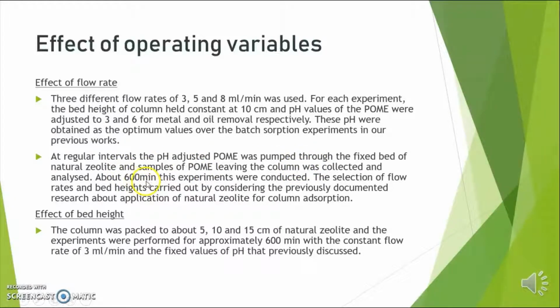About 600 minutes, this experiment was conducted. The selection of flow rates and bed height was carried out by considering previously documented research about the application of natural zeolite for column adsorption. Next is the effect of bed height.